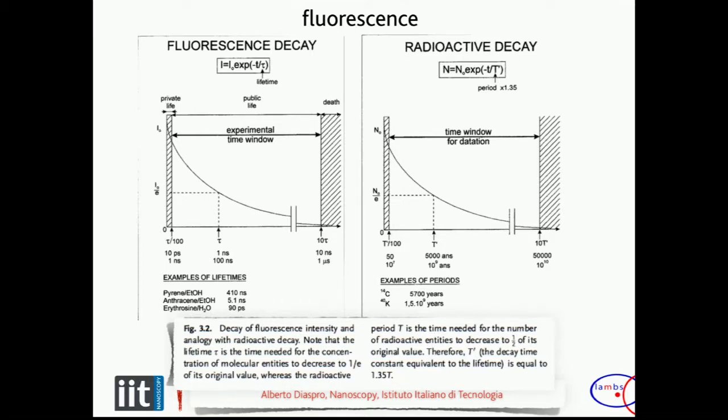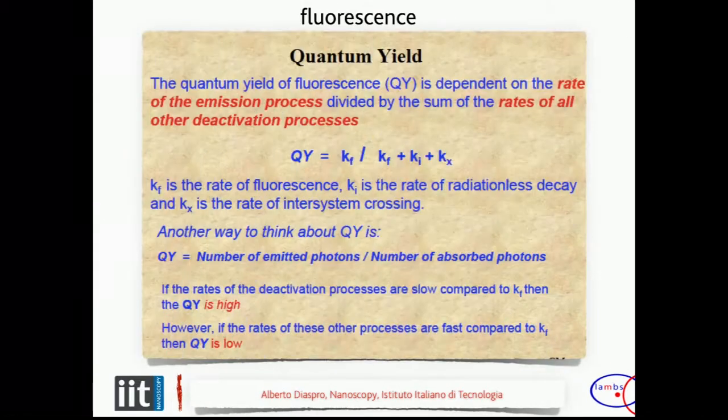When we think about fluorescence and microscopy, I think that most of us, including myself, think about intensity and a specific spectral window. But we have so many things that we can collect in fluorescence and that we can use for learning something from the emitting molecules, that probably you cannot imagine, or you imagine but you didn't use. Now, there is a quantity, the quantum yield, that tells you the efficiency of your molecule in releasing back the energy.